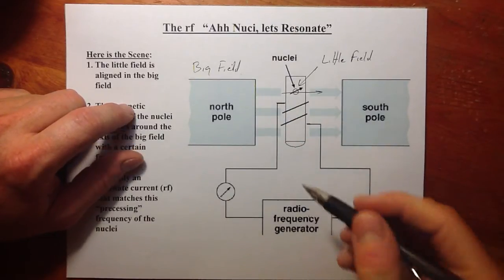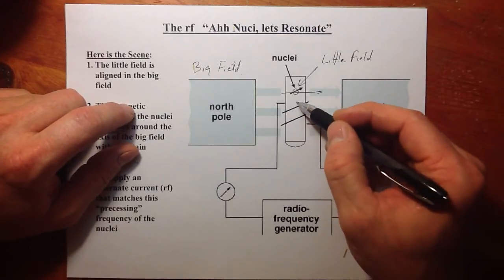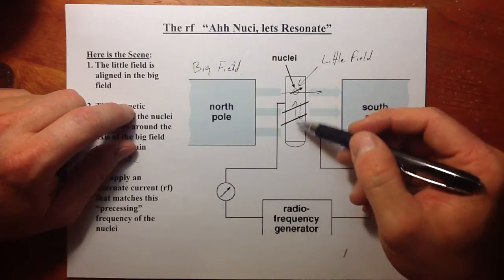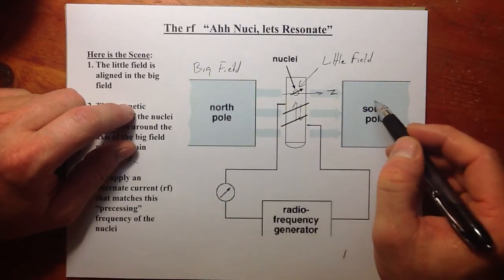Now what we could do is apply through a radio frequency coil of wire a magnetic frequency on the X and the Y, or on the X-axis or the Y-axis, however you want to look at it, this being the Z maybe, everything going in this direction.